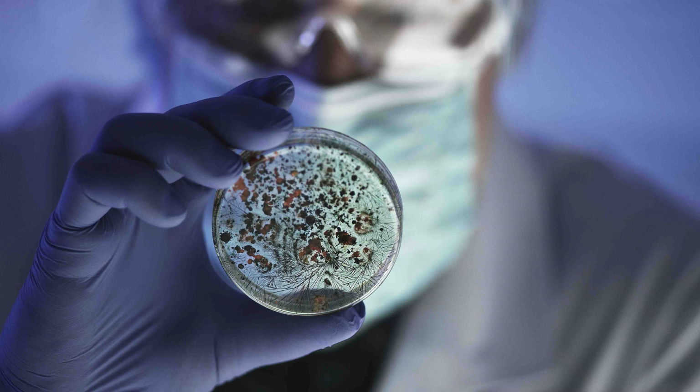Microbes don't live in isolation, as you may know. They form complex communities where each member carves out a niche, consuming resources and producing byproducts, which can be used by other members of the community or by plants and animals. Studying these communities is a challenge surmountable only through the utilization of a range of analytical techniques to identify key features of the community and how those features change in response to community structure and environment.